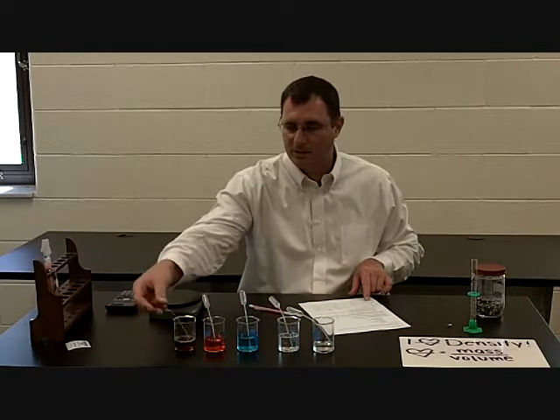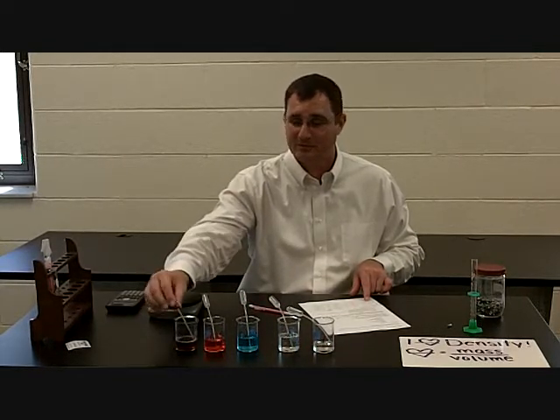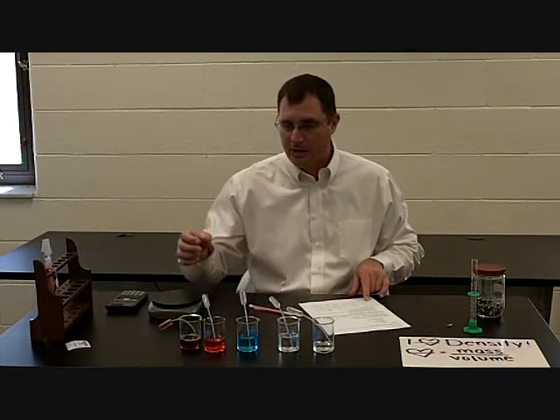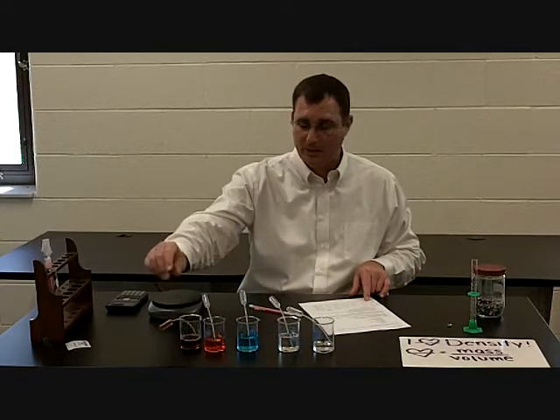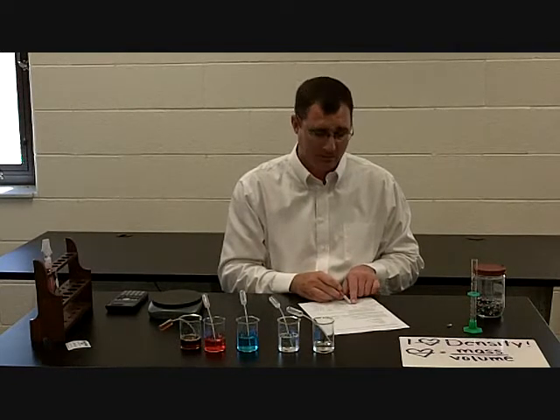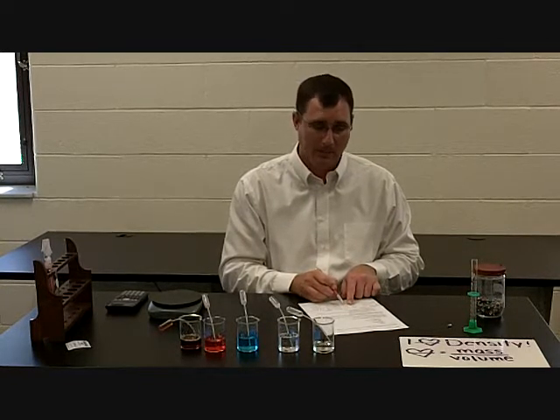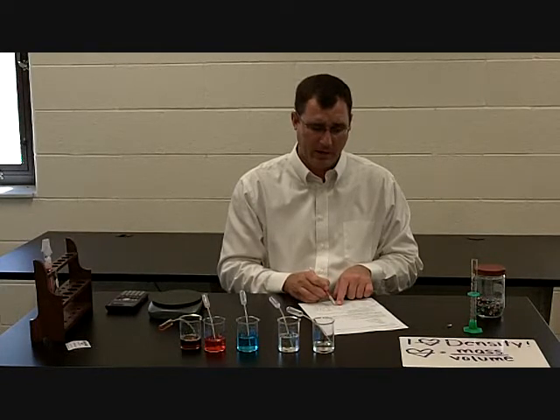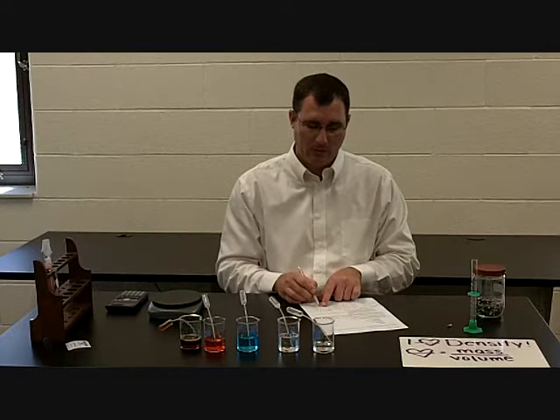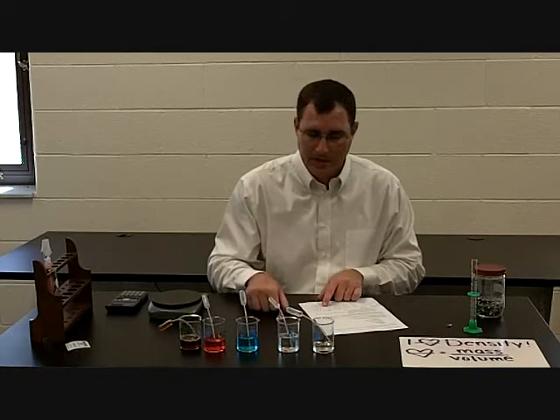And the last one is this maple syrup. It is hard to get up in here, okay? It's very viscous, it's a thick fluid. So we'll go ahead, we'll get it full. It takes about 4 or 5 minutes. We'll get the pipette full, we put it on here, and the syrup weighs 7.0 grams. I subtract my 0.9 for the pipette, which gives me 6.1 grams. I take that 6.1 grams and divide it by 4.8 milliliters, because that's the volume, and that gives me 1.3 grams per milliliter.